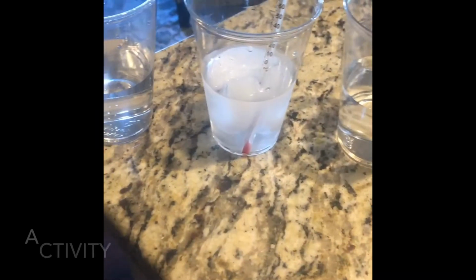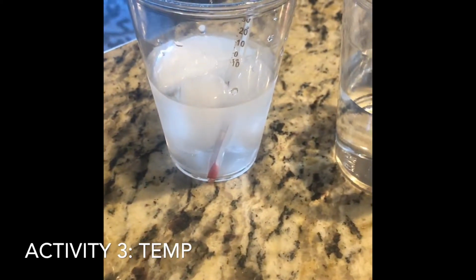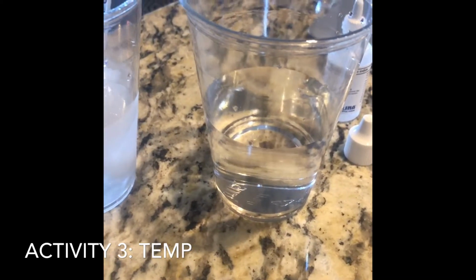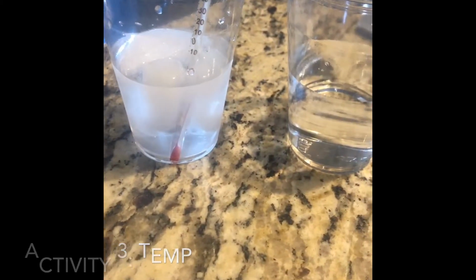Activity 3, this is for temperatures. So the first one's room temperature, it's about 25 degrees Celsius. This one's reading at about 5 degrees Celsius, and then the warm bath is about 45 degrees Celsius. I'm gonna get going so temperatures don't change very much on the warm and cold baths.